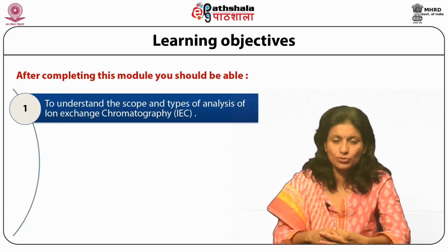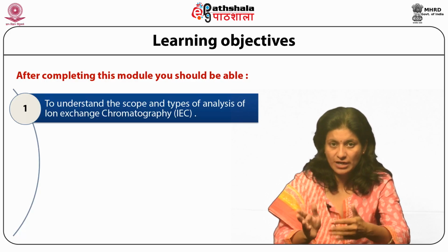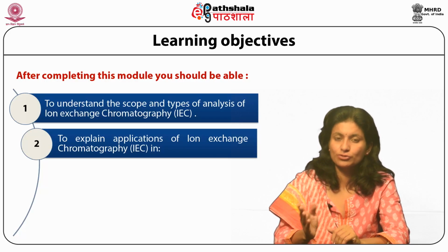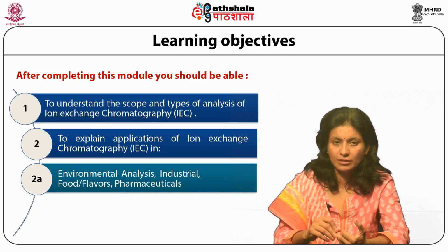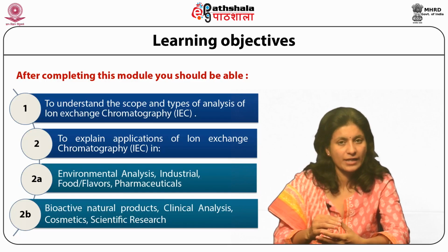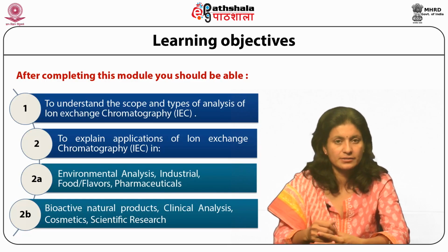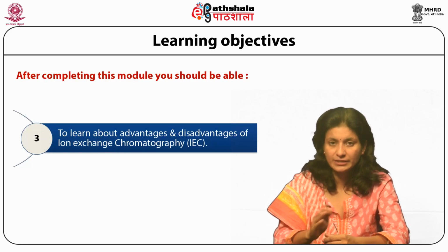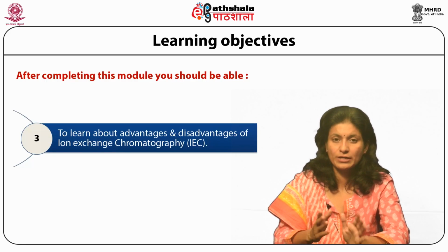To understand the scope and types of analysis of ion exchange chromatography, to explain applications of ion exchange chromatography in environmental analysis, industrial, food flavors, pharmaceuticals, bioactive natural products, clinical analysis, cosmetics, scientific research, and to learn about advantages and disadvantages of ion exchange chromatography.